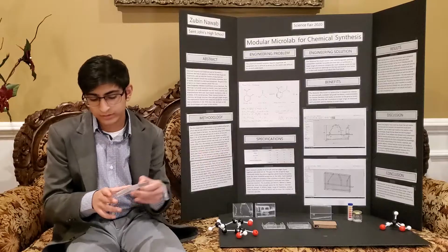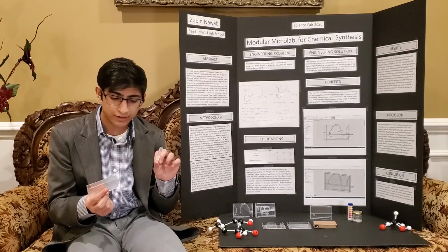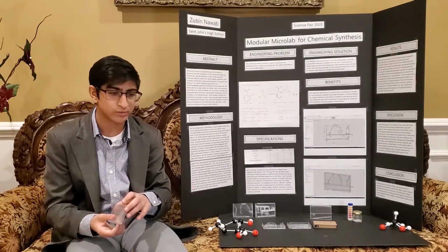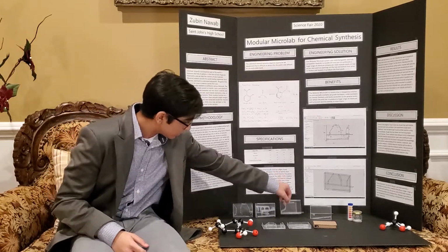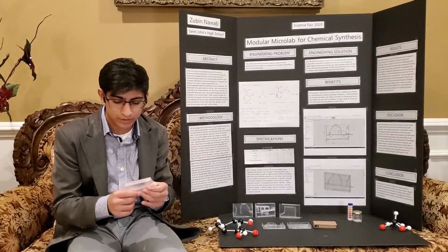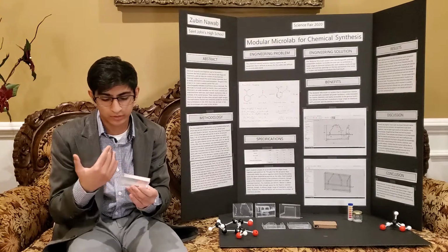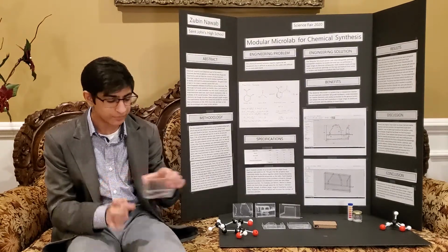This is the heating and cooling module. It can be used as either. It has a second compartment to have a specific temperature to allow the chemicals to have a specific temperature because of conduction through the acrylic piece over here and over there. This is the filtration module. It filters the things, and if you're having a solution, you can keep the solid or the liquid. You can choose between them.